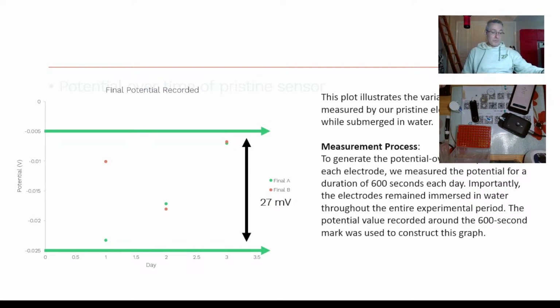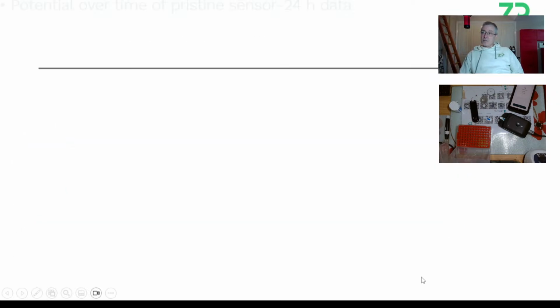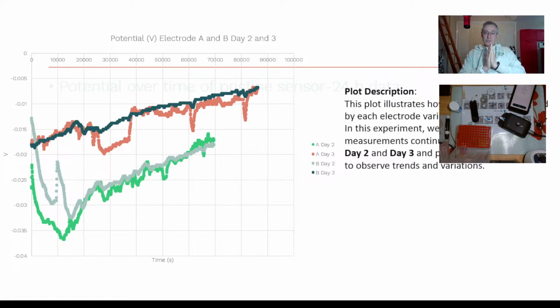So I would not want people to think that we were suggesting that a screen printed electrode from ZP is going to be rock solid in an OCP measurement over 3 days. Now you will see me show you some really good data, but we had to work really hard at that, and I'll try and give you some clues about how we actually went about that. But thank you so much for giving me the data.